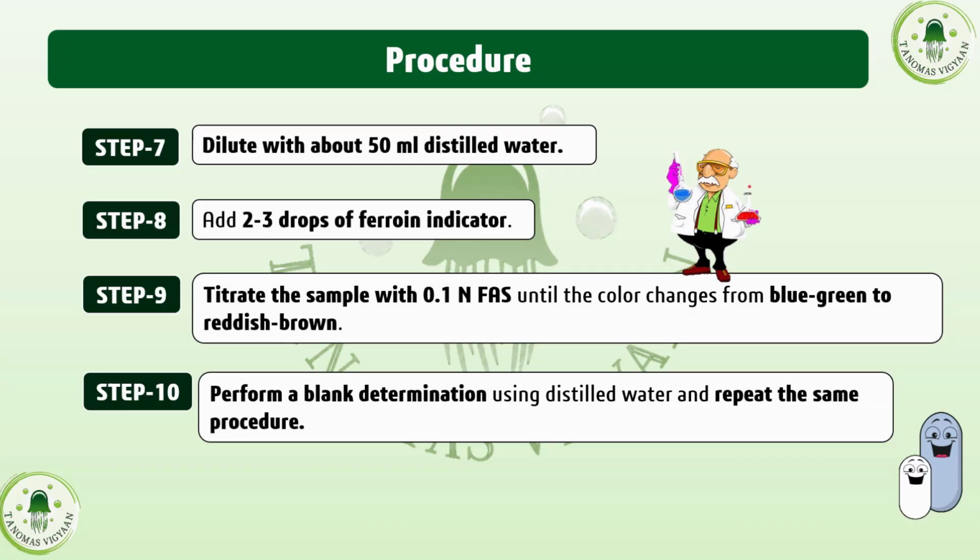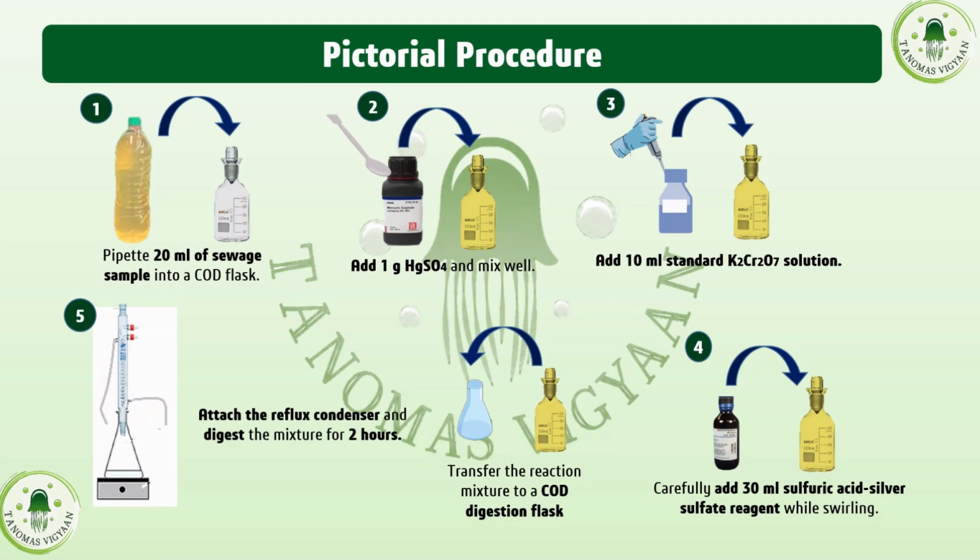And proceed for the calculations. Okay, so this is not a very difficult procedure to follow, but make sure you make all the standard solutions which you need, the 3 reagents which we are using. Make sure you make them beforehand, before you start this experiment. Now let us see the pictorial procedure again.